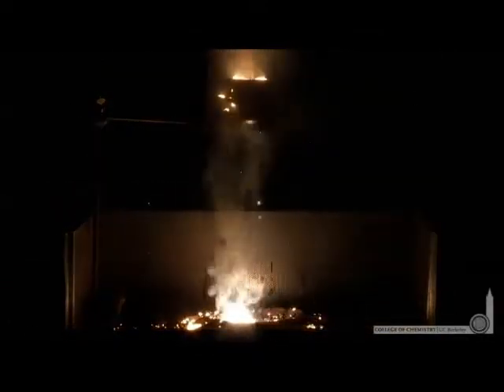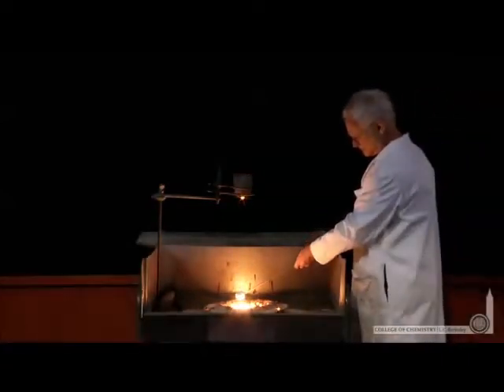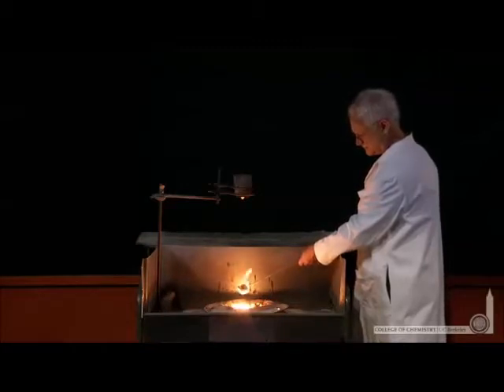So there's a chemical reaction that's so violently exothermic that the product is molten iron. Lonnie can come in and demonstrate that there's still a tremendous amount of heat being given off by that iron. Indeed, such a tremendous amount of heat that Lonnie can enjoy one of his favorite campfire favorites.